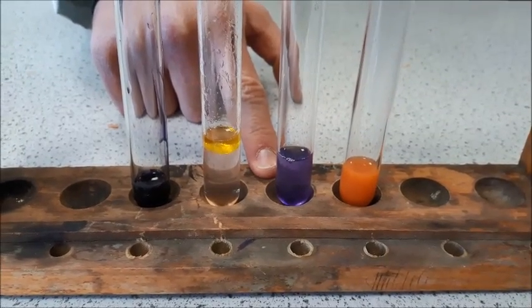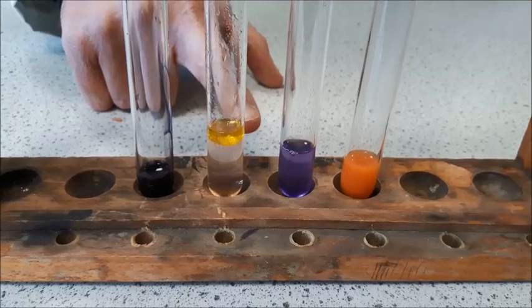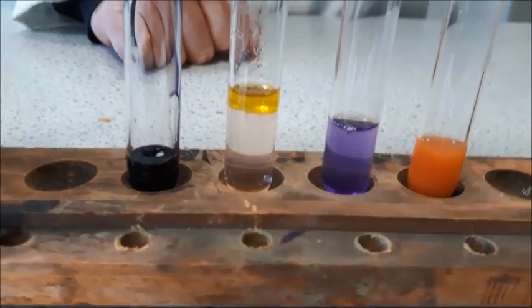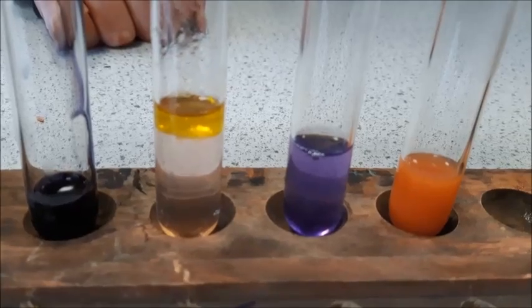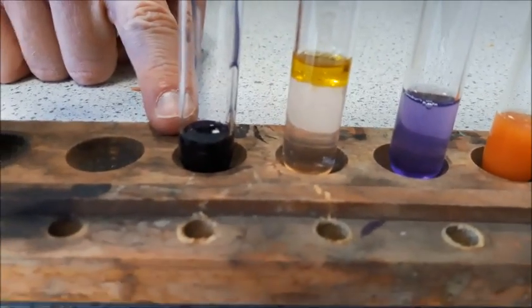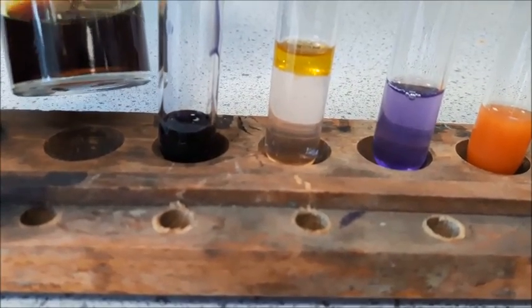Here is the test for protein, which has turned a lilac-purple colour. And you may on the top layer here just be able to see some red flecks in our solution — that is where the Sudan 3 is attached to the oil. Finally we have our iodine solution which has turned from the original brown to a very dark blue-black.